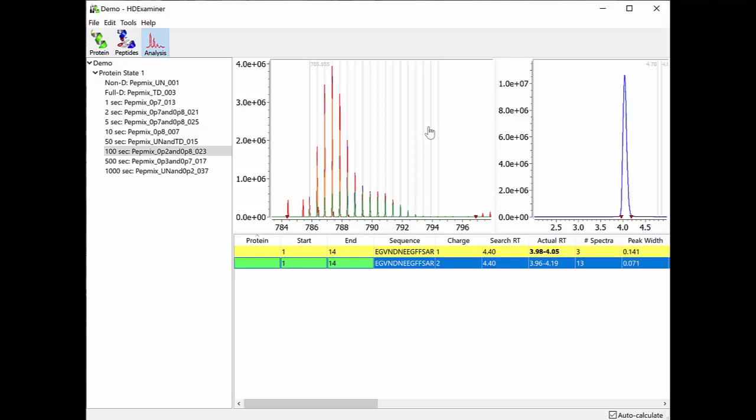Now, there's enough to cover here under bimodal distributions that we've actually made a completely separate video for it on our YouTube channel. So head there to check it out. If you're watching this video on YouTube right now, there's a link to the other video in the comments below. So check out that video and learn more about how HDExaminer now handles bimodal distributions.